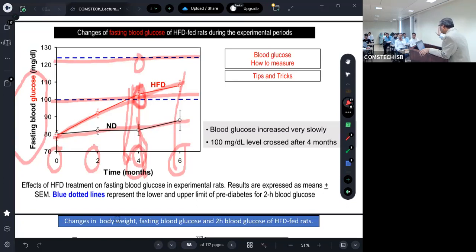Option 2: we did it at night, at 8, 9 or 10 p.m. Sometimes we came to the animal house. For this project I have a specific assistant who is very good in animal handling. At 9 or 10 p.m. we came to the animal house, removed the food, and next morning we did the experiment. For fasting, there is no way; you have to remove the food.